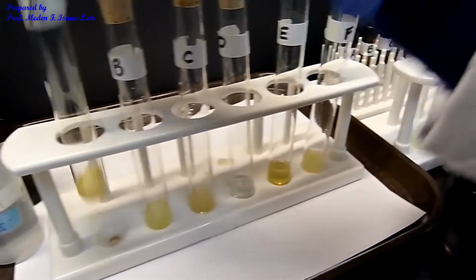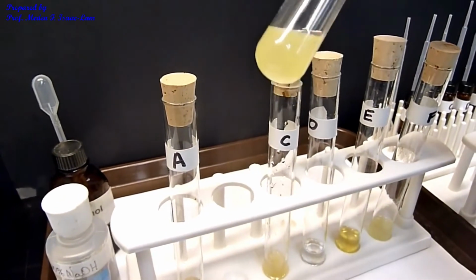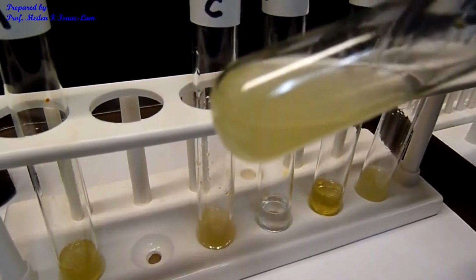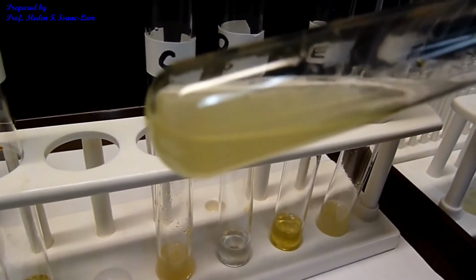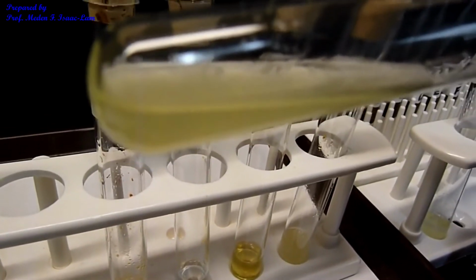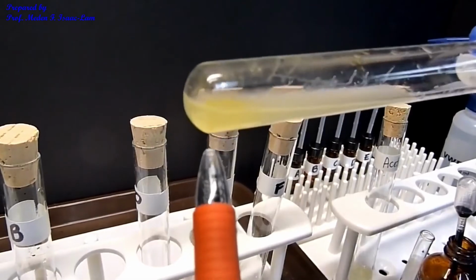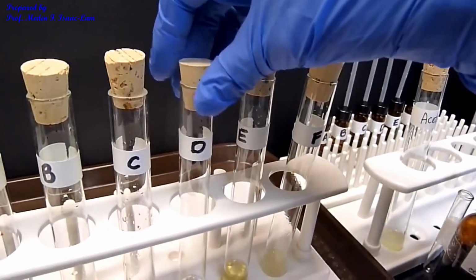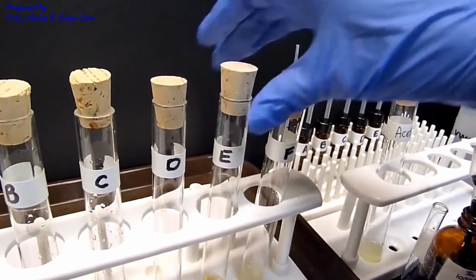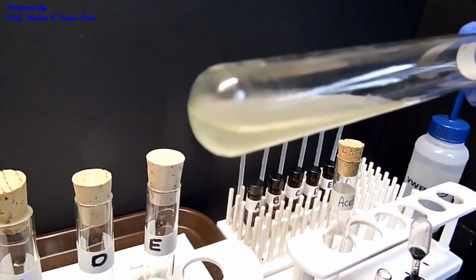So let's go back in here. So nothing on A. And then on B, I see some. So on B, you can see that there is now formation of the precipitate. It was a little bit slower than C, but I can see now actually, if I tilt it, you can see it at the bottom. Again, C, you see quite a bit on here. And then D, nothing. It's very clear. And then again, E, nothing. And then F, there is some turbidity, but I don't see any precipitation.